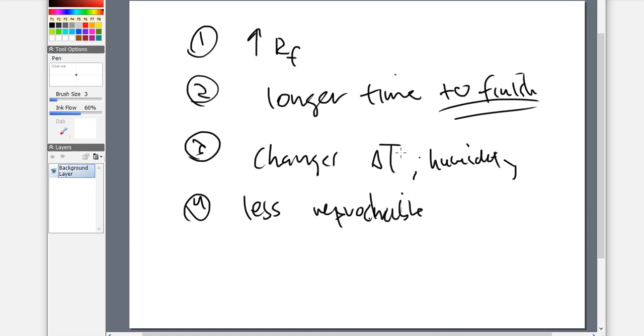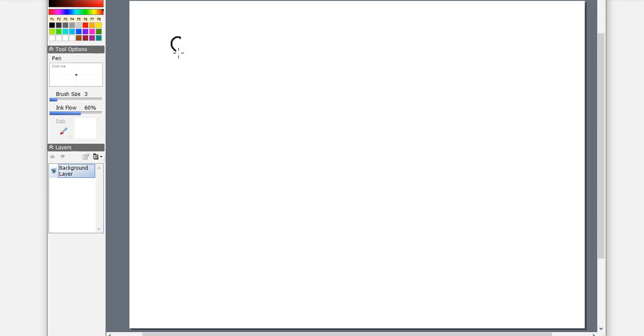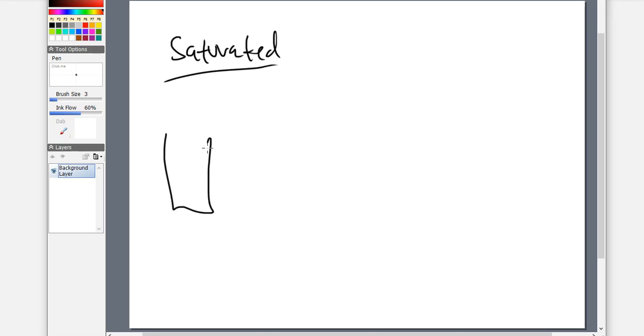All right. Next up, another version of development that we can have is something called saturated. We can do a saturated development. And what happens here is that in this chamber, we get mobile phase on one side and mobile phase on the other side of that twin trough. So both troughs are going to be filled here with developing solvent. And then one is going to have a filter pad or a filter paper on the back side. So I'm just going to put FP for filter pad or saturation pad.